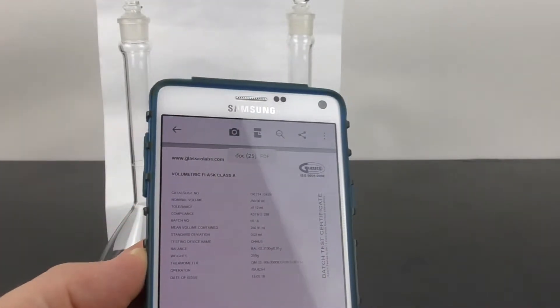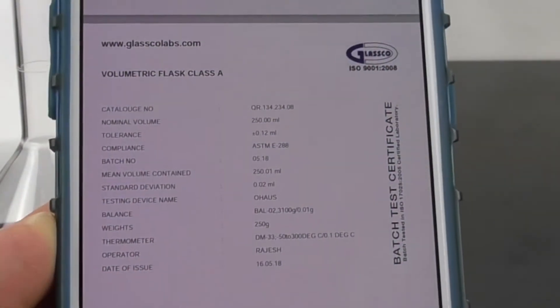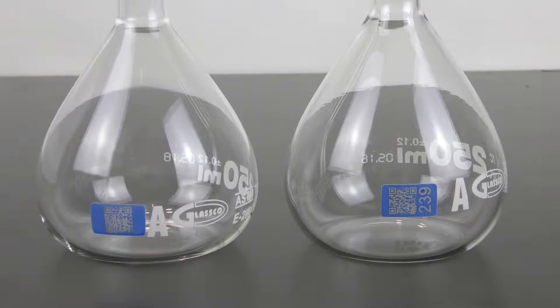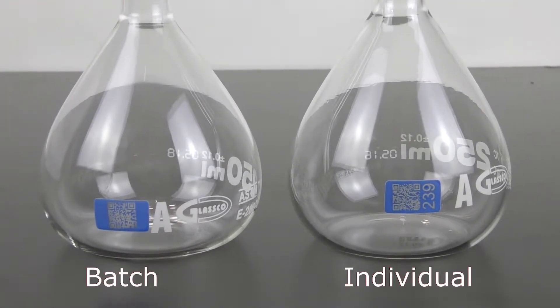On iPhones, you don't have to do that. And there it is — there is your certification. I just showed you how to read the QR code on a batch certification.